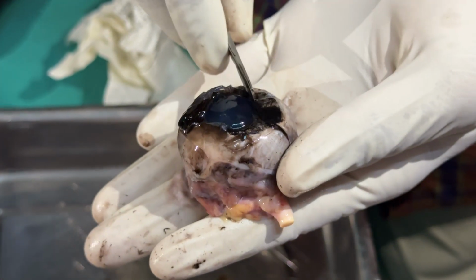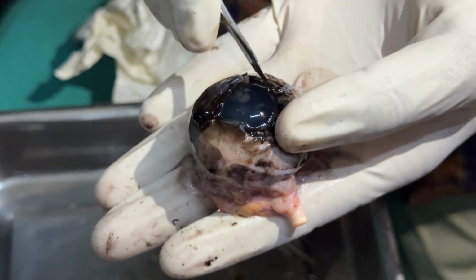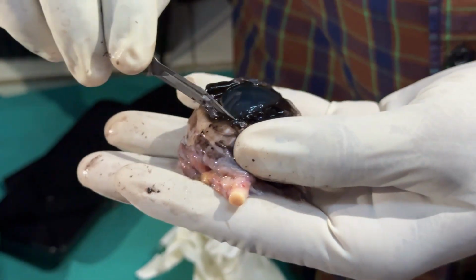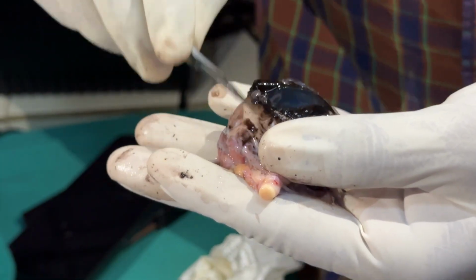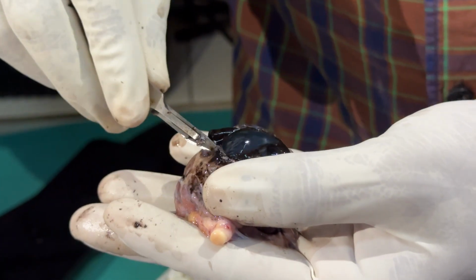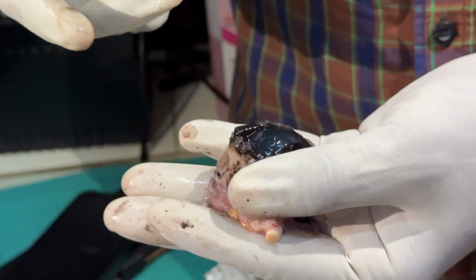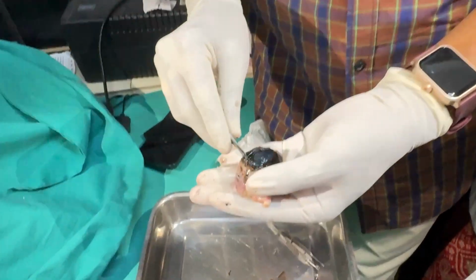After dissecting over the sclera, we can see the lens capsule and suspensory ligaments. The ligament I call the suspensory ligament attaches the lens and protects it from shifting or displacement. This is the suspensory ligament, or zonule of Zinn. You see, now I am cutting that. Actually, this lens is the portion which separates the eyeball into anterior and posterior segments. And this is a crystalline biconvex lens. I will take it now.